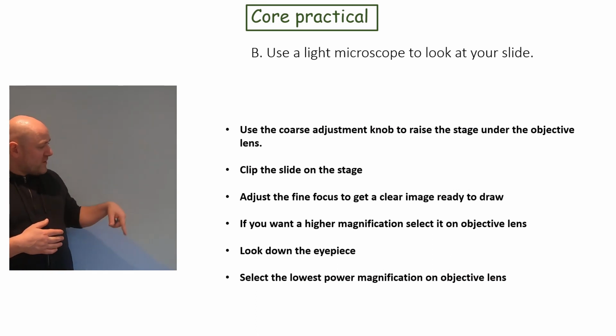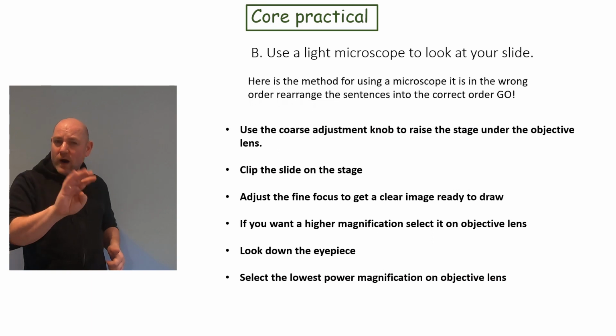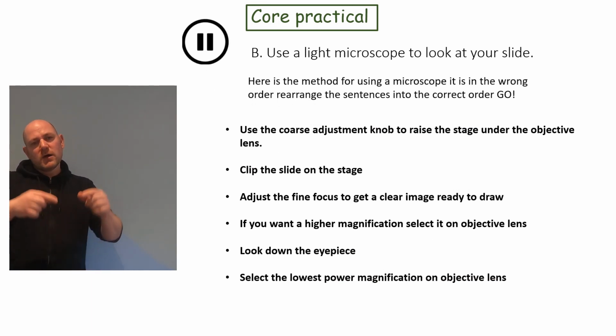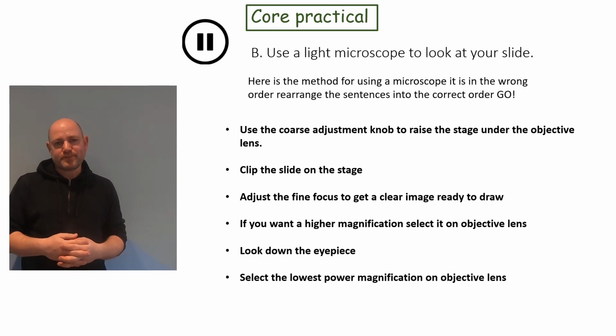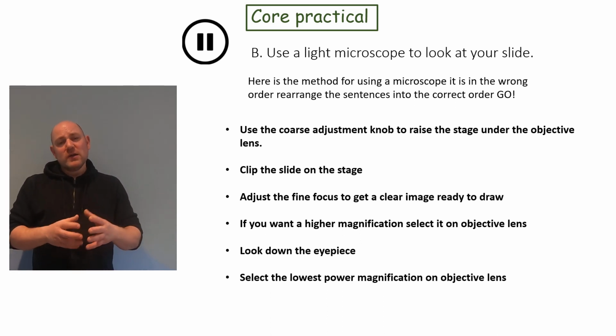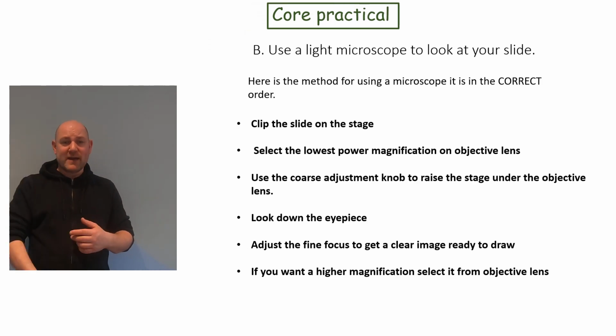Now, here is the method for using a microscope. You probably won't get a 6 marker, but maybe a 4 marker asking you how to use the microscope. So pause the video, try and rearrange these sentences into the correct order. Okay, you've probably done that by now. You can choose to write these down, or you can always follow these videos along and just do them in your head. But here's the correct order.